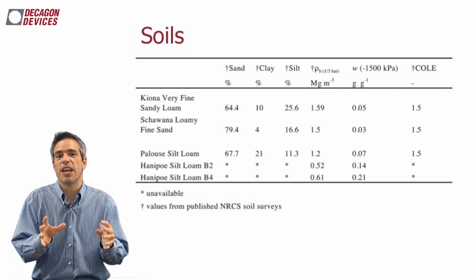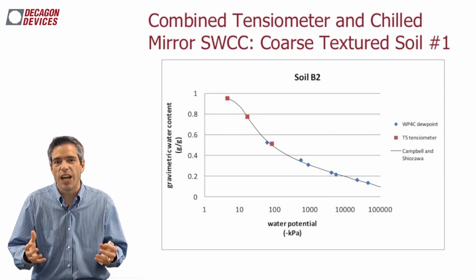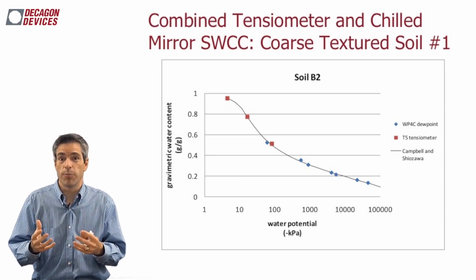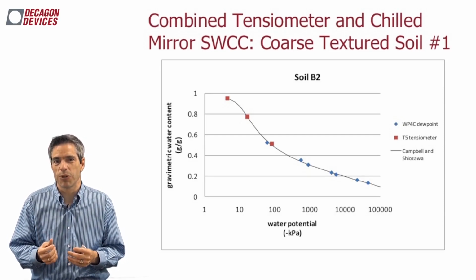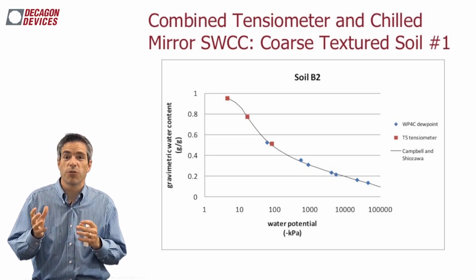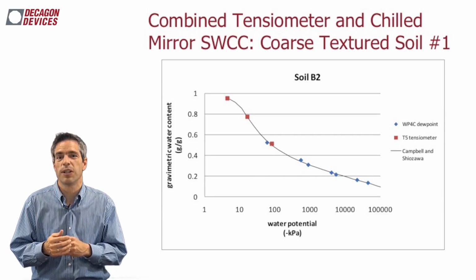So I'm just going to take you through a few of these SWCCs for these different soils, not to get in depth about what the particular results mean in terms of knowledge, but just to show you what you might see in your laboratory. I don't have time to actually delve into it beyond that. So the red points we see here were just tensiometer. We didn't actually use the Wind-Schindler technique on this particular experiment.